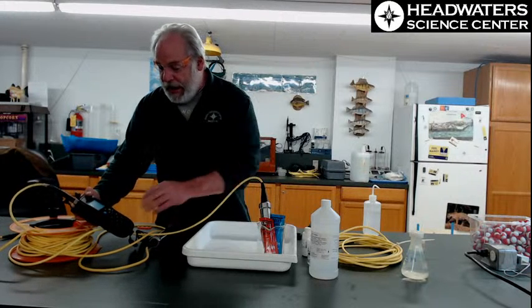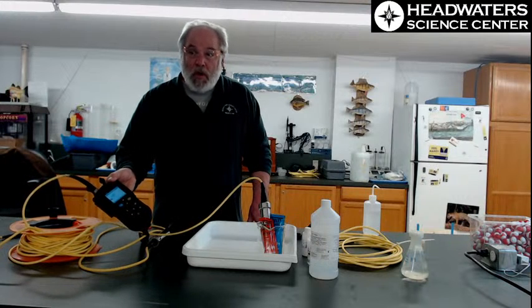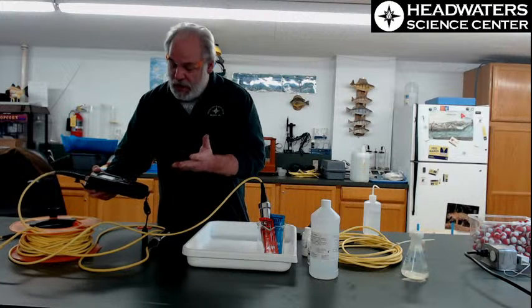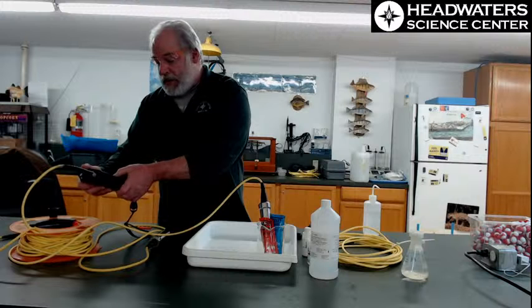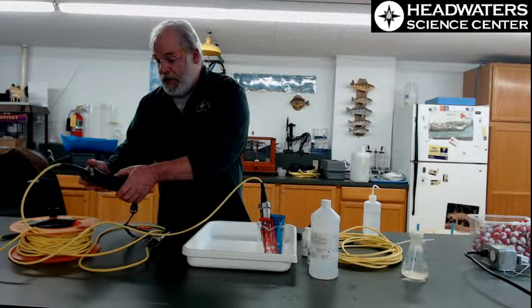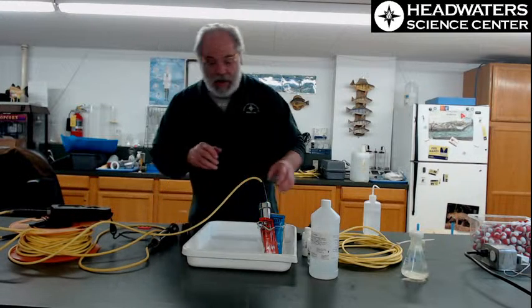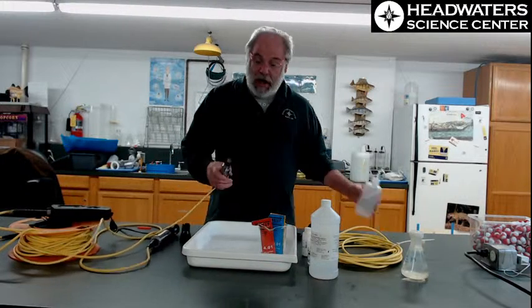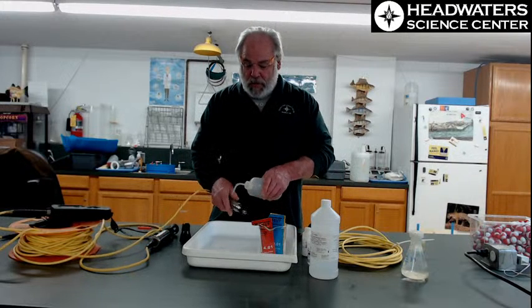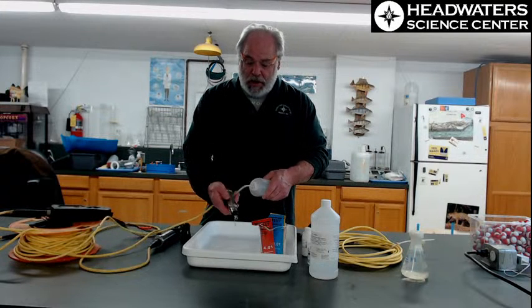So I'll calibrate it at that, get the calibration going, and the meter that used to read 4.05 now reads 4.00, closer to where it was. So it was off just by a touch, and this meter told me, yes, you passed the calibration for 4.0, and I'll store that in there, and I'll have that first calibration set and met. And now it has 4.0 on its probe, so I have to rinse that away. You have to do this every time because now the meter is carrying 4.0's worth of reaction.